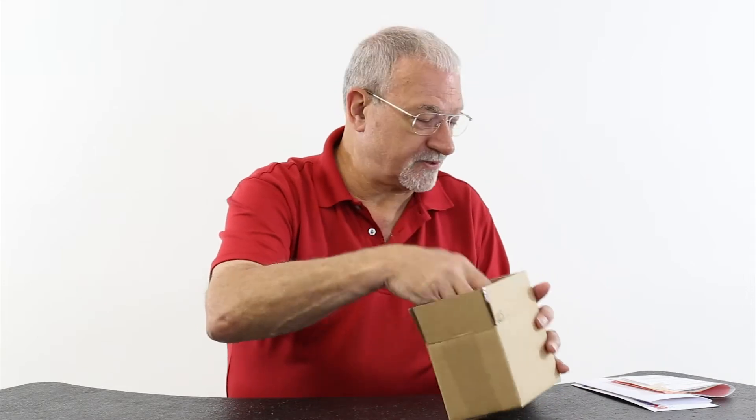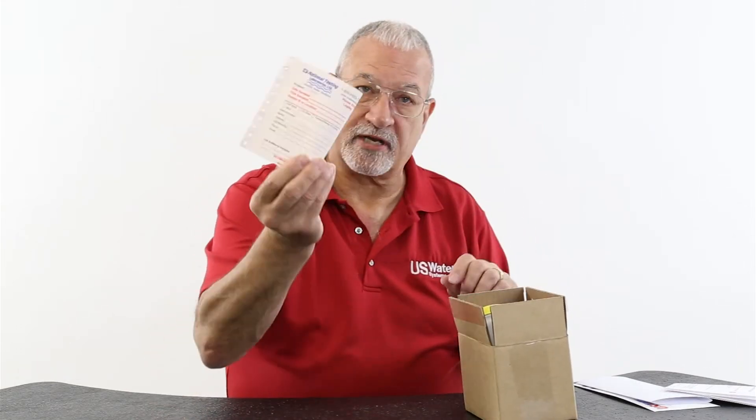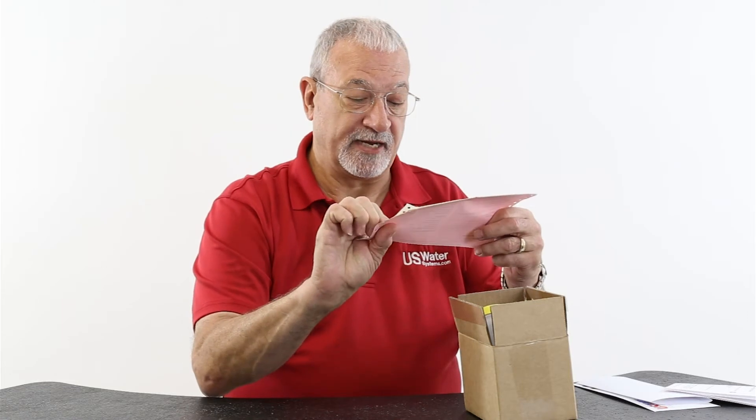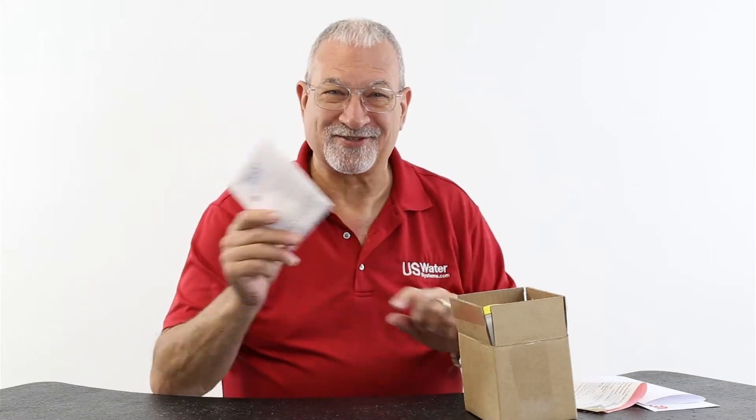You put it back in the box. There's some other paperwork in here that will already have your name on it, and it goes in the box. You're going to keep one copy — it's marked that the yellow is your copy. The instructions are also included in here too, if you can't remember how to do the test I'm just showing you.